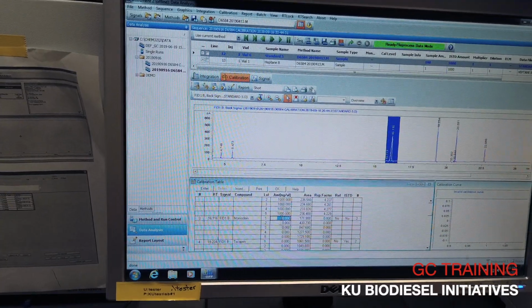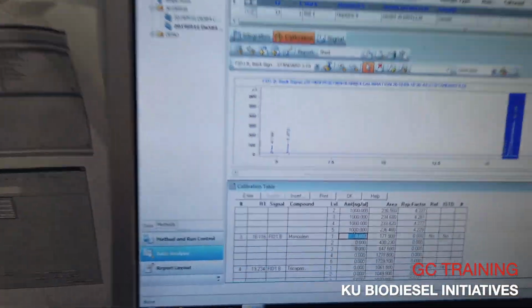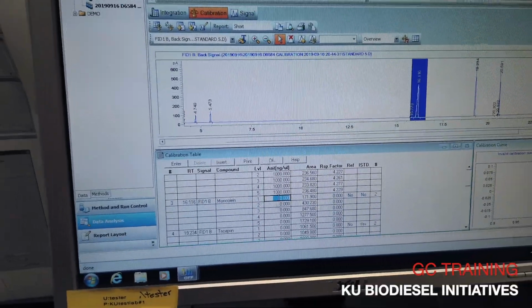That's fine. I thought so, but I didn't want to make any assumptions. So yeah, let's go through and do this, and then we can look at what the curve looks like, and then we can take the opportunity to decide which ones we need to check.